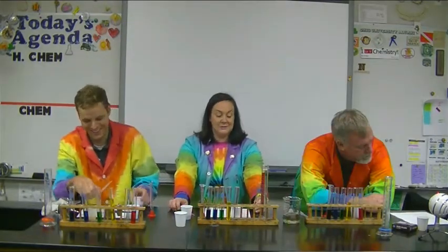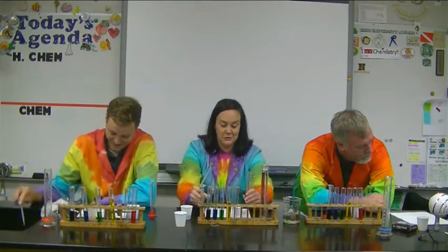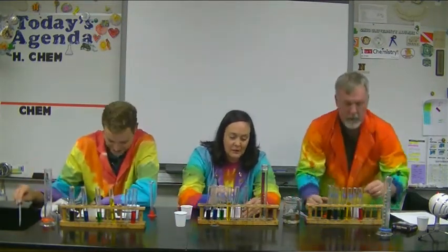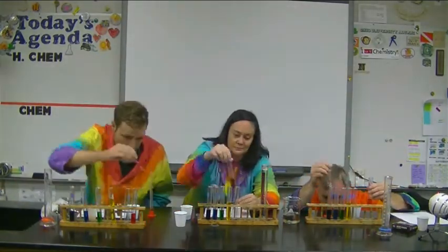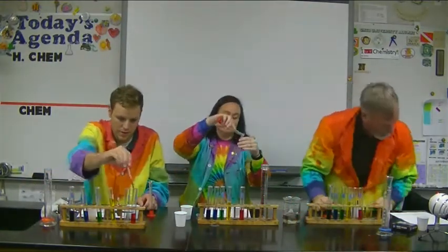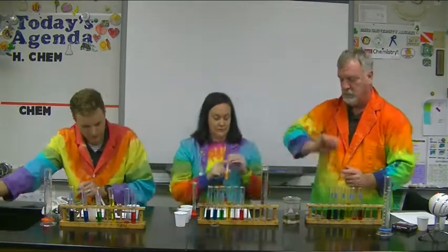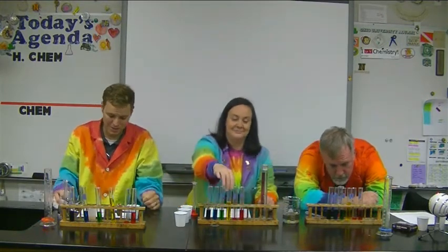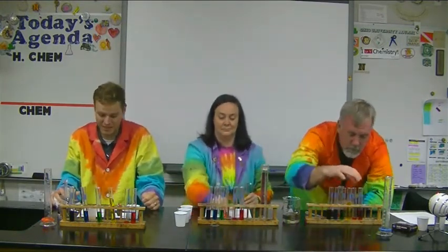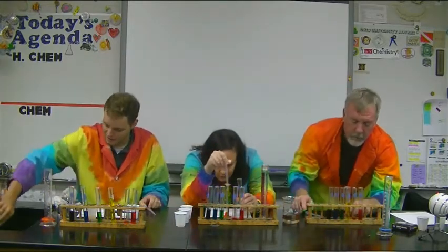Step 11, transfer 2 milliliters of solution in test tube A to test tube B. 2 mils of A to B. Step number 12, transfer 9 milliliters of the solution in test tube C to test tube B and mix. 9 milliliters.